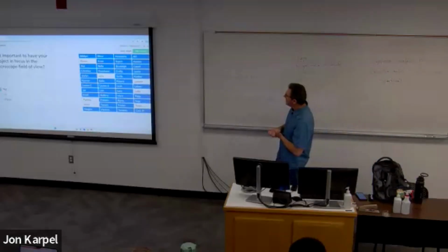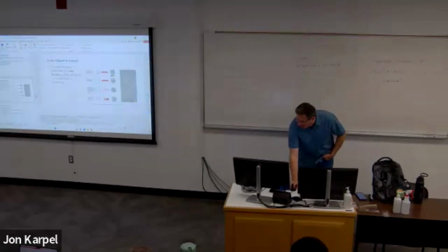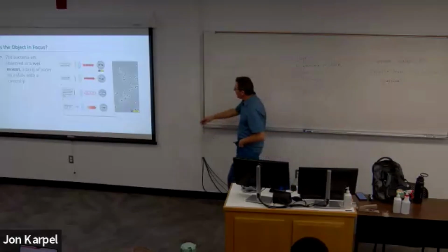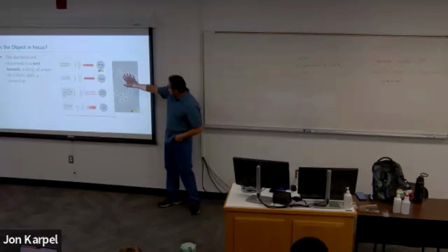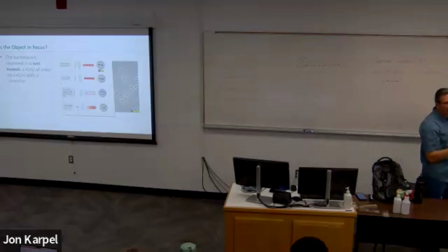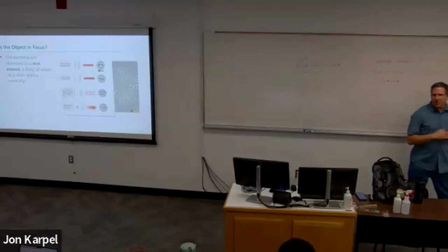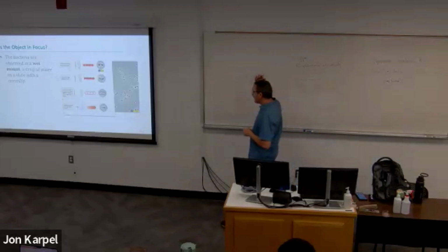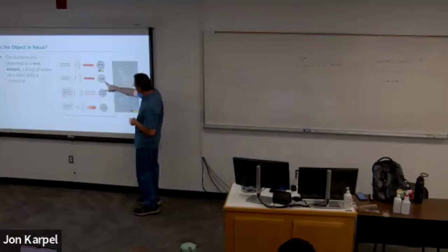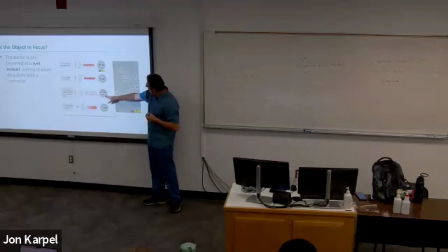Yes, it is important to have your things in focus. If you don't have it in focus, then it's going to be really hard to see what's going on. So in this sample here, you can see things in and out of the focal plane. So this will take some practice. When you're in lab, you're going to practice setting up the microscope, making sure you're actually looking at what you're supposed to be looking at, and then focusing so that you can see a nice sharp image.